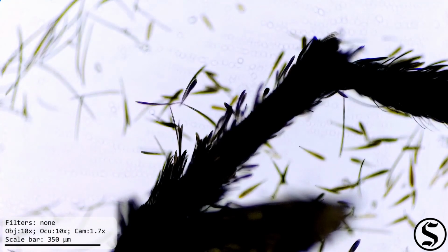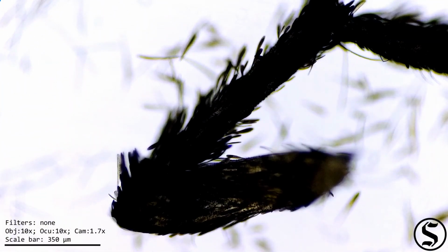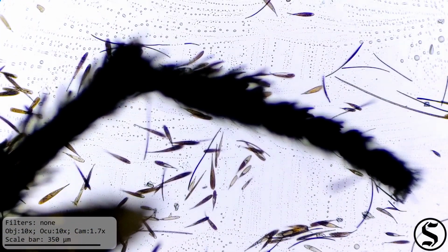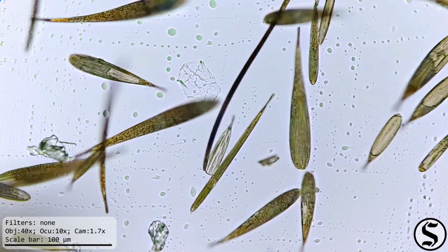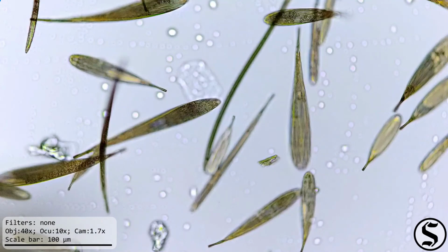And we can see that it's surrounded by little scales, very similar to what we see on a butterfly. And those look really neat. I think these are what compose the sort of powder that the moths and stuff leave behind on surfaces, these little scales.